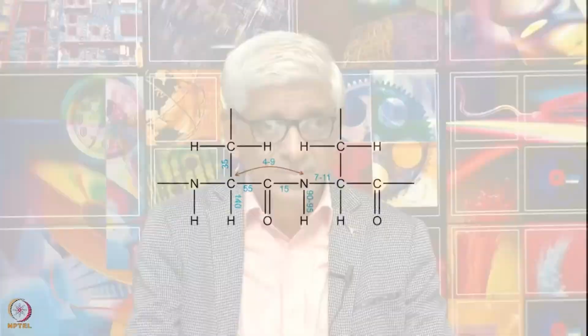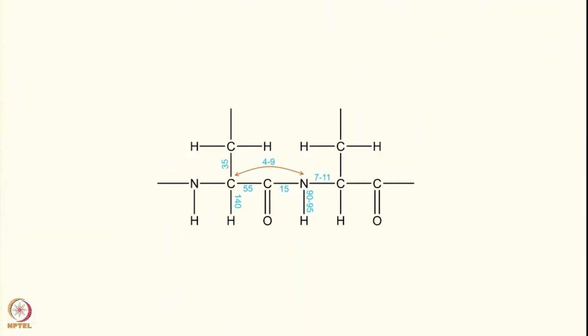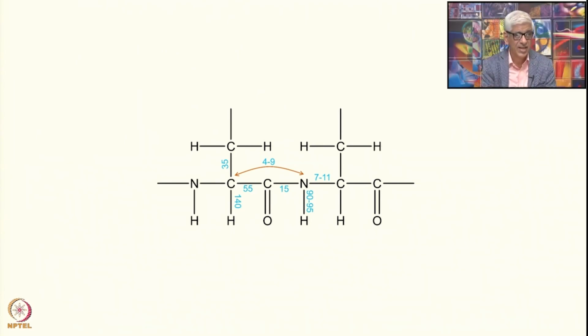Okay. Now these experiments are dependent on the transfer pathways, and how does the transfer occur? The transfer occurs through the J coupling, and these are all one bond J couplings, and these numbers are indicated here. The advantage is that these are not dependent on the conformation of your protein, and these are always the same. Therefore, there is no question of missing a correlation in this kind of experiment. So, you have these various coupling constants indicated here.